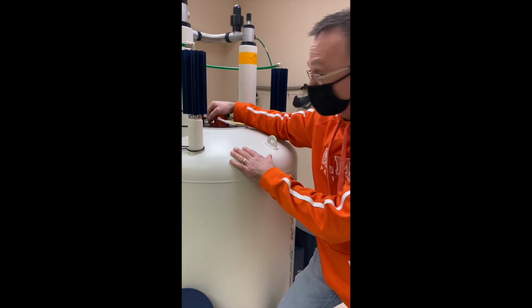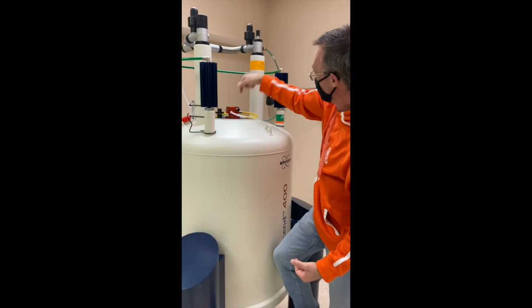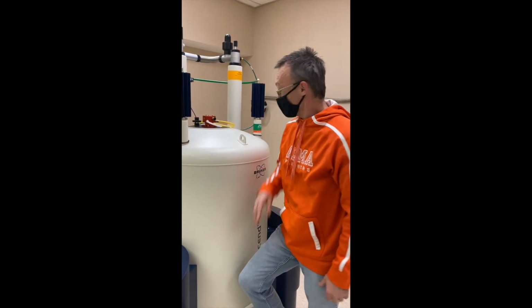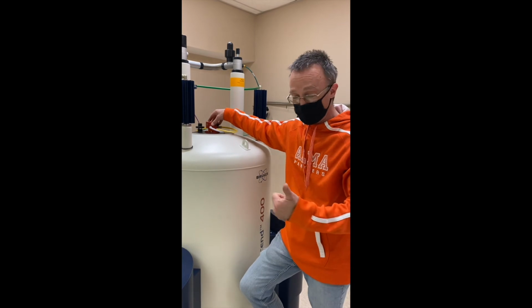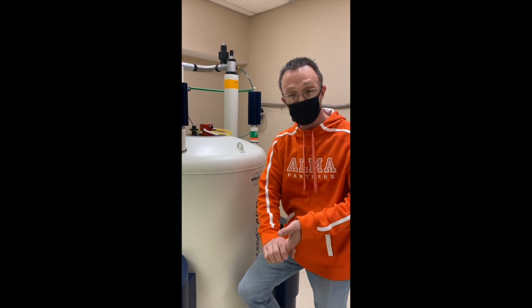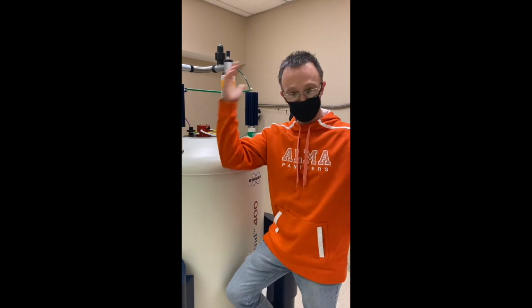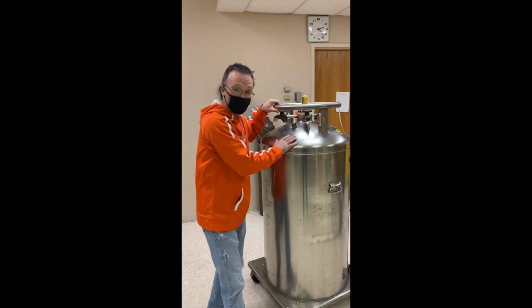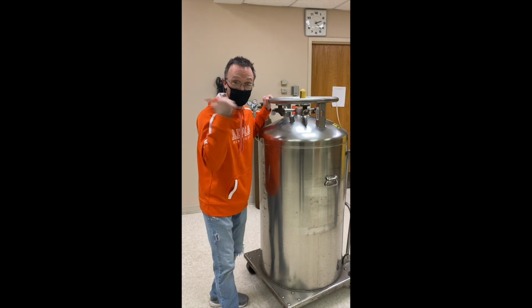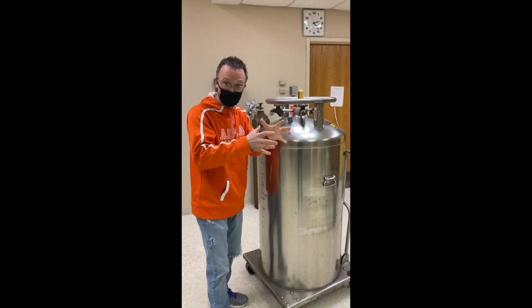If you were to take this instrument and make it really large and lie it on its side and climb inside that hole, that would be an MRI. So NMR stands for nuclear magnetic resonance spectroscopy. The MRI at the hospital stands for magnetic resonance imaging spectroscopy. Same thing. About every 2 or 3 weeks, we order 265 liters of liquid nitrogen to feed that beast and keep it cold. That's why they call it a superconducting magnet, because we keep it so cold.